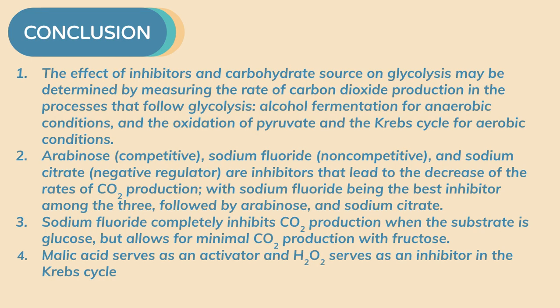Third, sodium fluoride completely inhibits carbon dioxide production when the substrate is glucose, but allows for minimal carbon dioxide production with fructose. Lastly, malic acid serves as an activator and hydrogen peroxide serves as an inhibitor in the Krebs cycle.